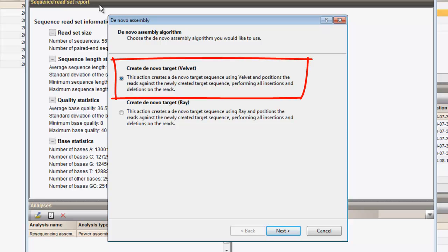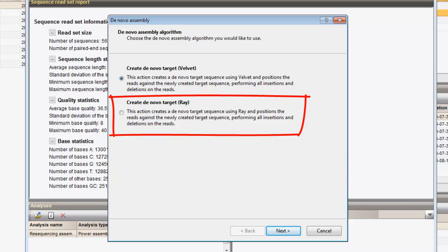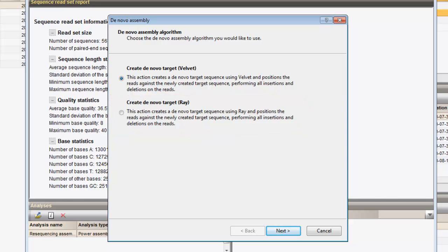Velvet is a set of algorithms to manipulate high-throughput sequence data for genomic sequence assembly. The algorithm is ideal for high-coverage short-read datasets. Ray is a parallel short-read assembler which has been developed to assemble reads obtained from a combination of sequencing platforms. In this example, we will use the Velvet algorithms.